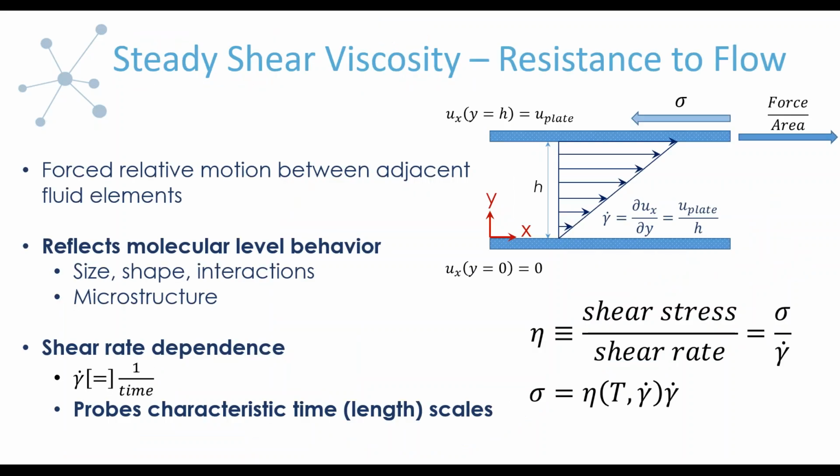Okay, so just to remind everyone what viscosity we're looking at, I won't spend a lot of time here, but I wanted to bring it up because one of our earlier webinars this year discussed how many different types of viscosity there are. So that we don't have any confusion, what we're presenting today is all steady shear viscosity, and this is the most common one. If anyone just says viscosity, this is likely what they're talking about. And as we know, it's a gauge of the resistance to flow.